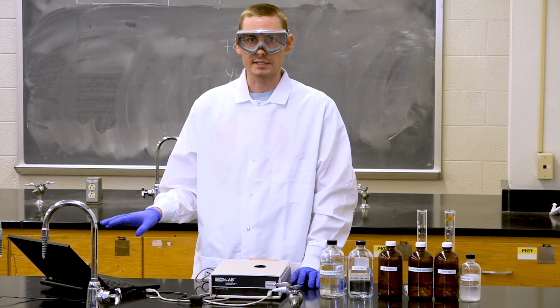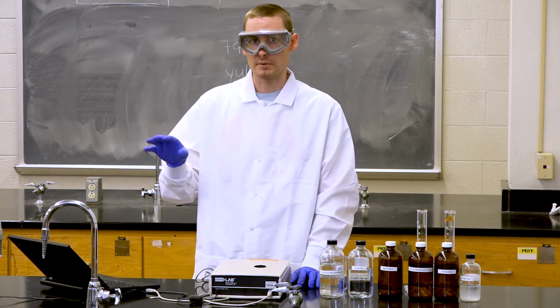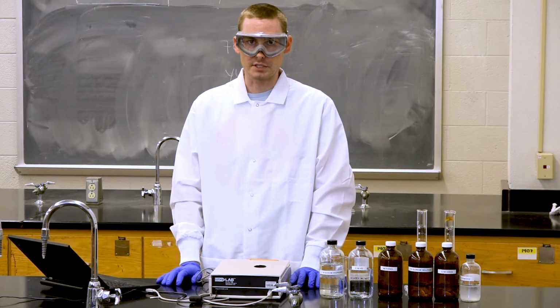This is the only thing you'll need for this lab, because we're not going to be doing any graphing with time or anything like that. So we don't need to add any more sensors. We're ready to start the experiment.